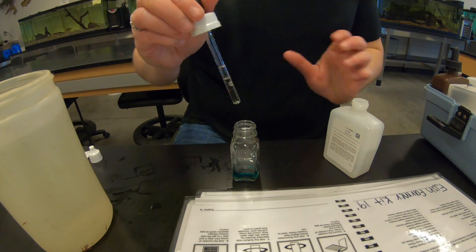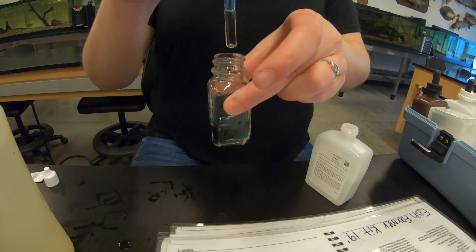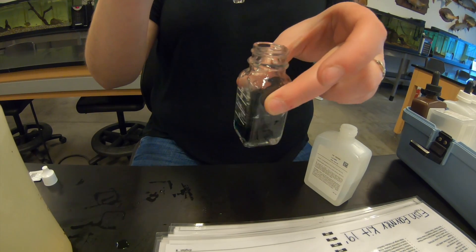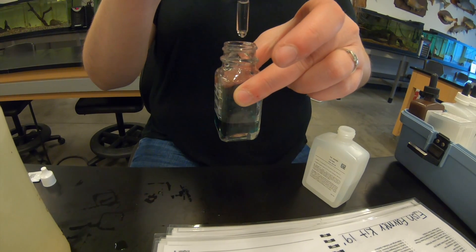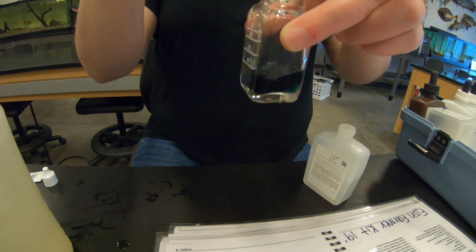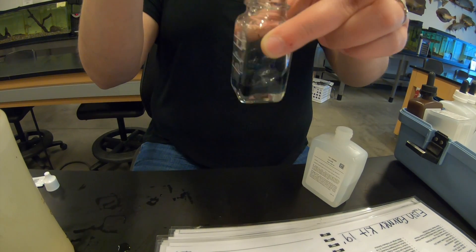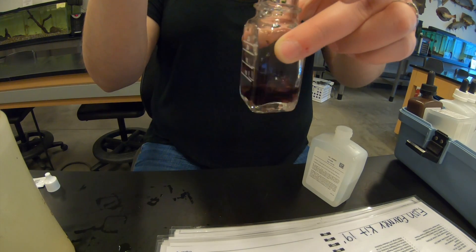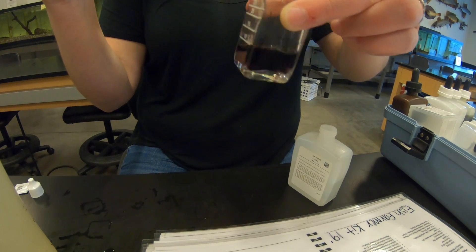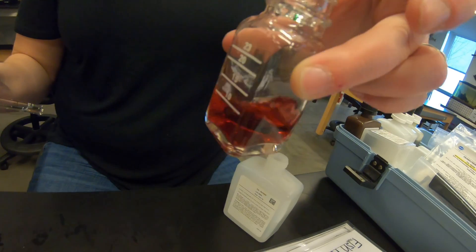Adding drops one by one and swirling to mix after each. No color change yet at drops one through three. At drop four I can see it start to change a little. Continuing through drops five, six, seven - it still reverts back to green. At drop eight it's close, and at drop nine we have our stable color change. Nine is our number.